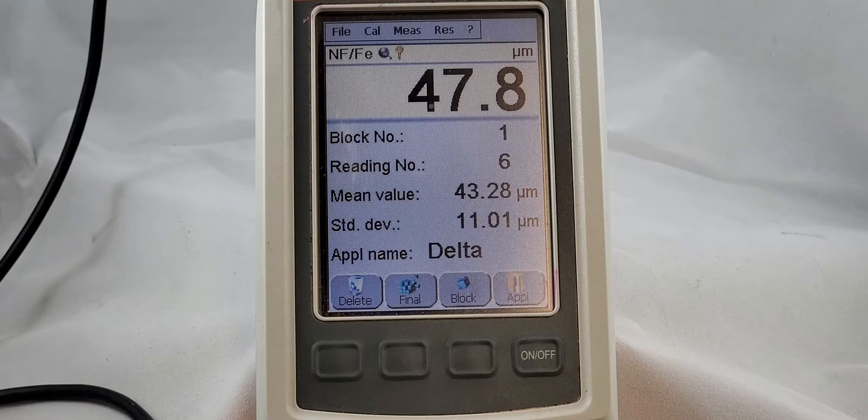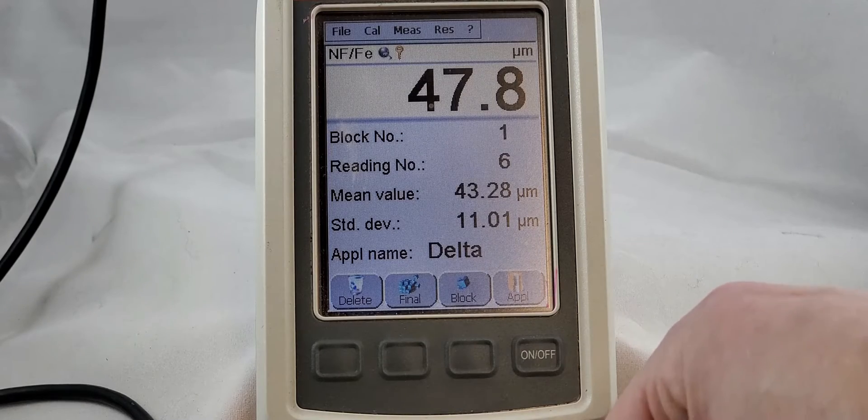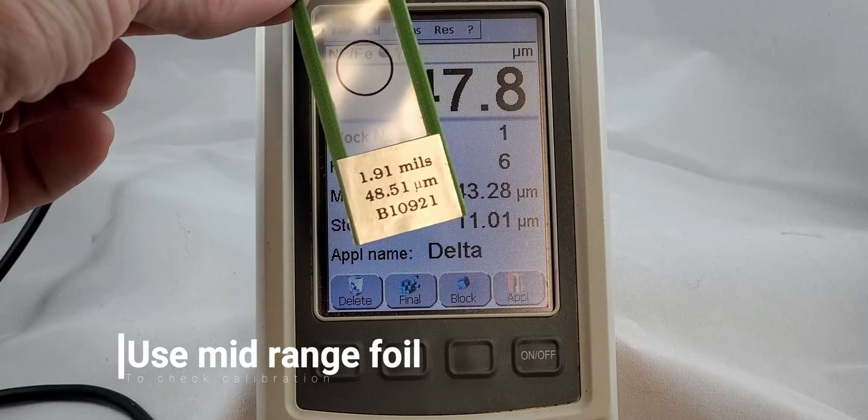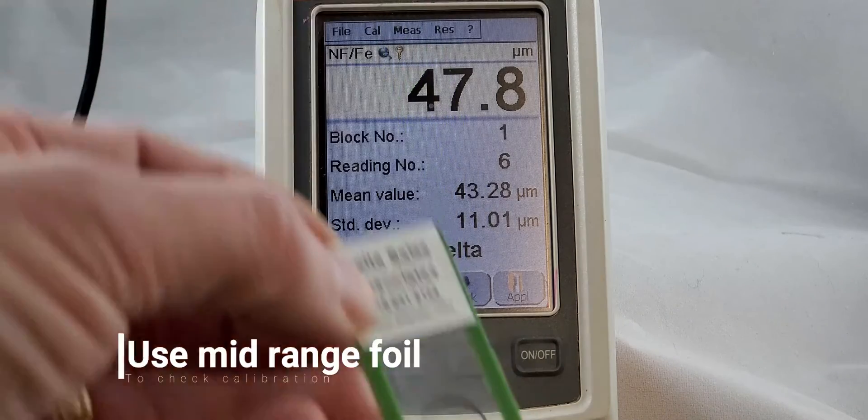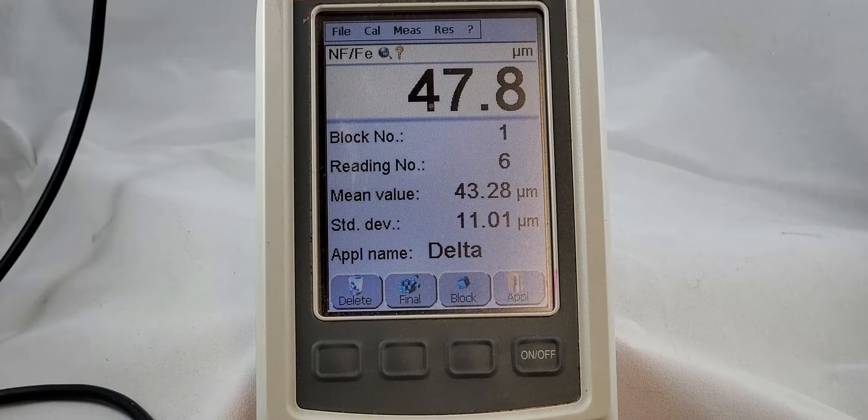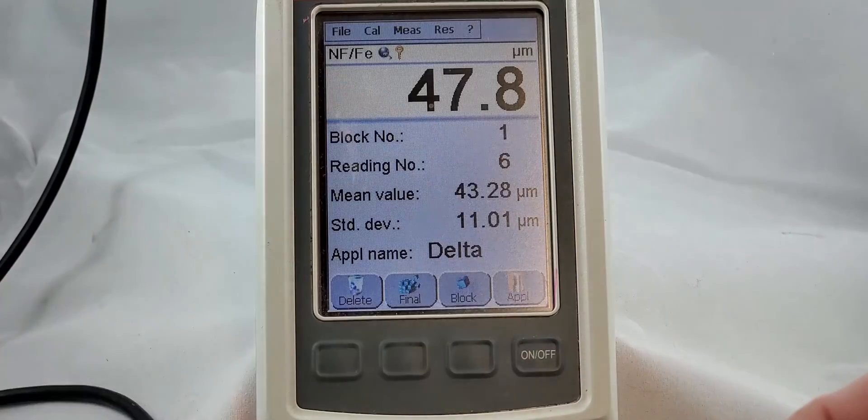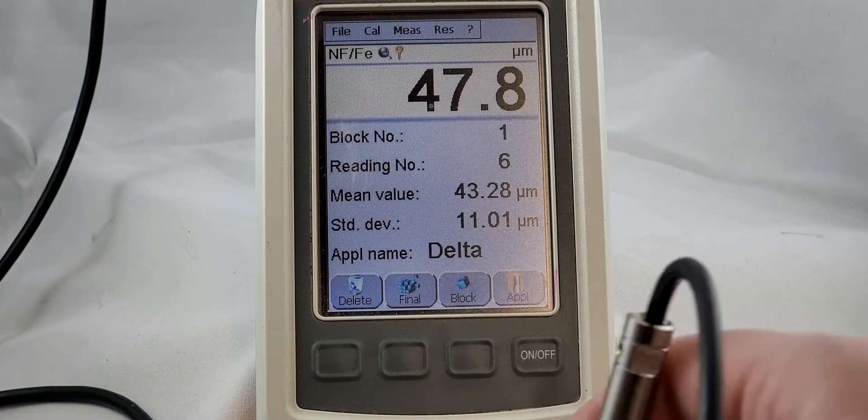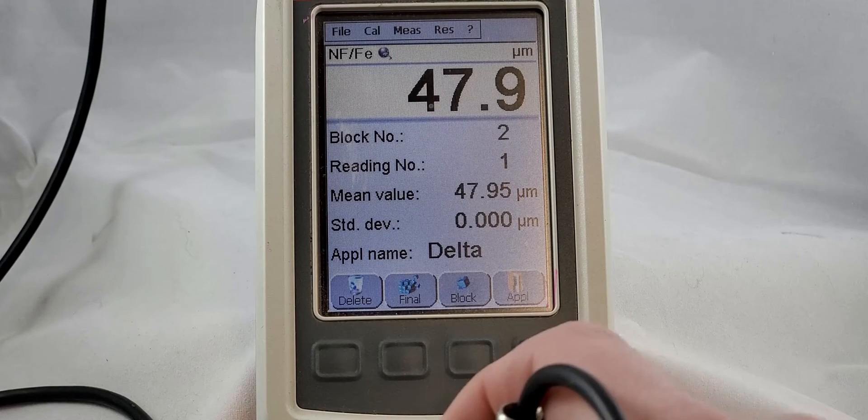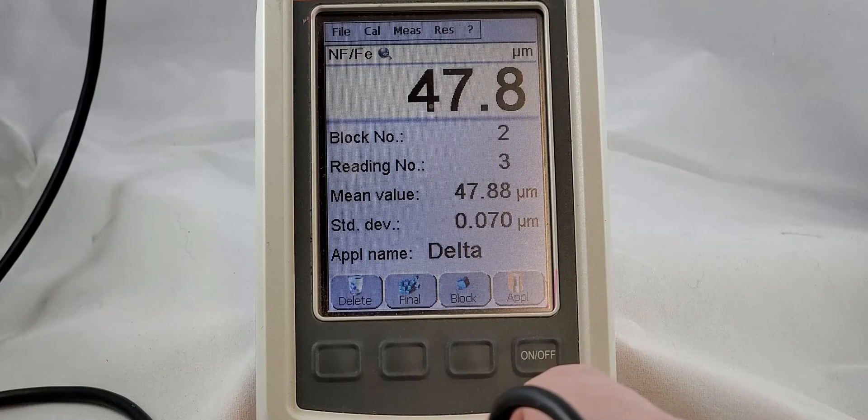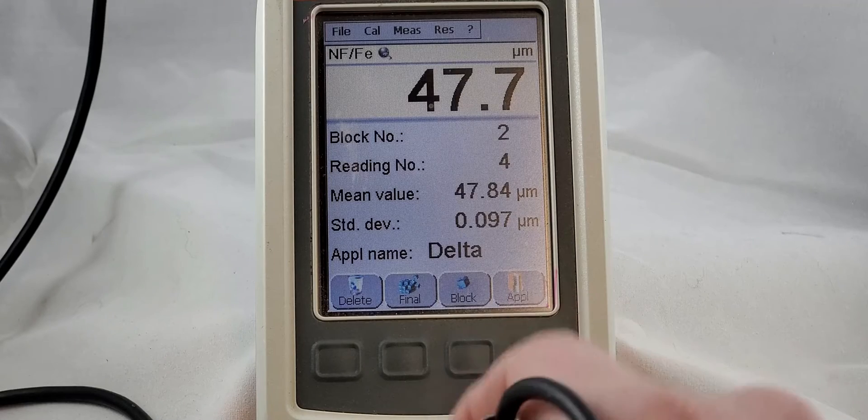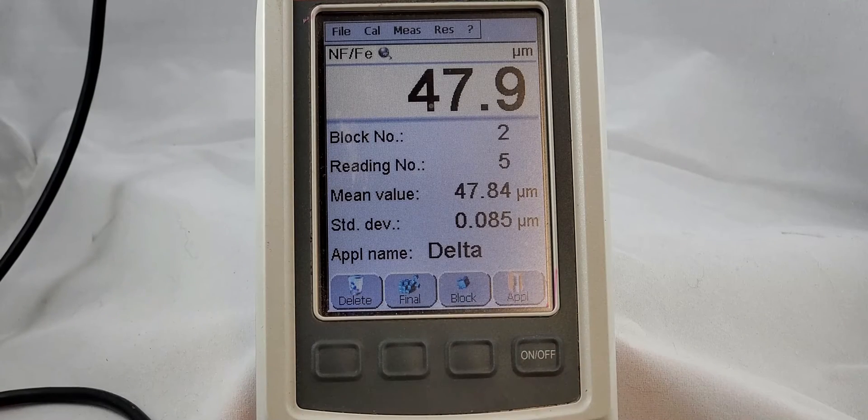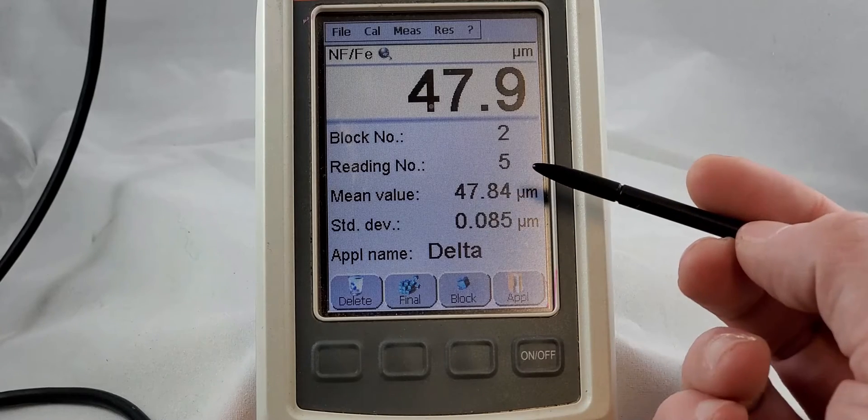So once my calibration is done, I always like to check my values and that's where that 48.5 value foil comes in. That was the foil that was right in the middle of our range. That is a perfect place to test our calibration. And again, let's just take five readings. One, two, three, four, five.